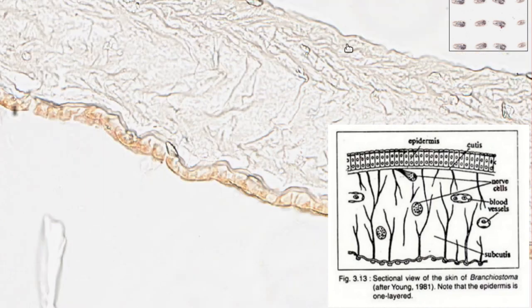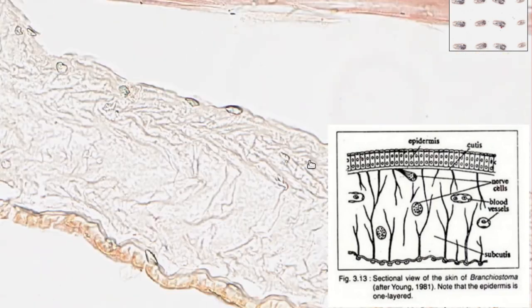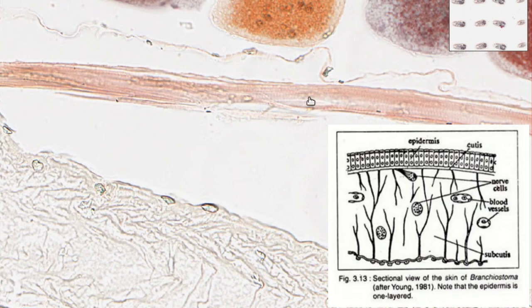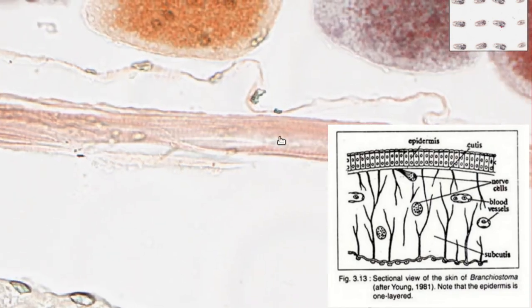Nerve cells would be extremely challenging to find. They've probably not stained particularly well on this section, but congratulations to anyone who thinks that they can find something on these slides that looks like a nerve cell. So then below the skin, below the subcutis, we'll reach the muscle layer.